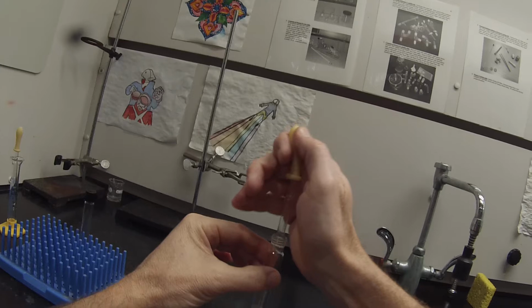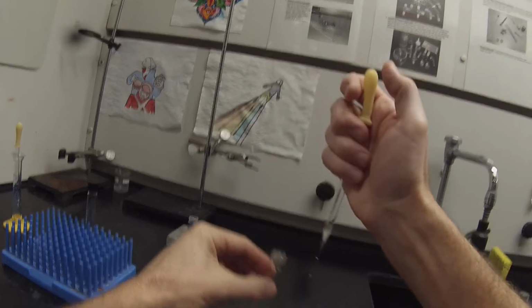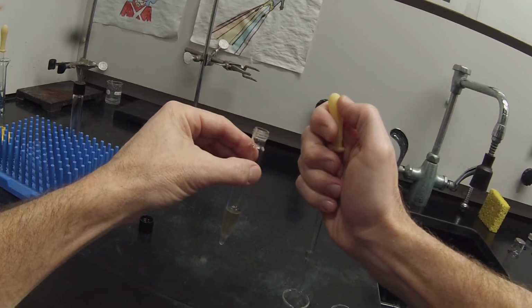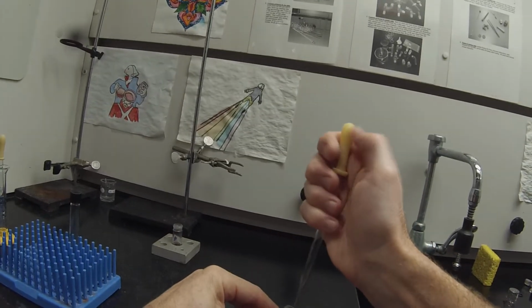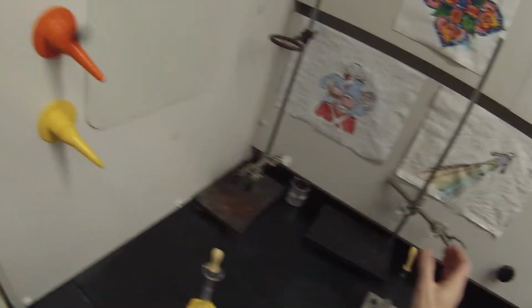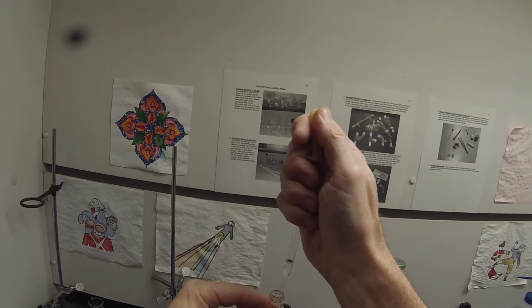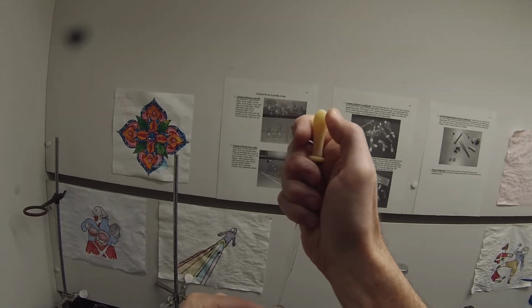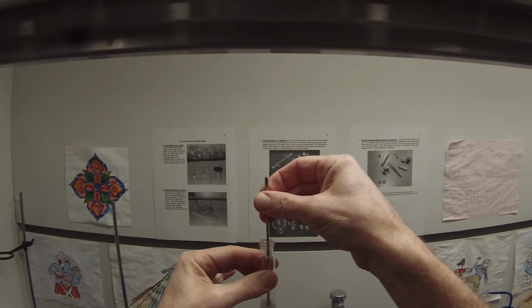And just a tiny little bit more. And we'll drip that aqueous layer in. And transfer the remaining top layer back. Add our third wash. Should get less CO2 generation this time. May need a fourth wash, so I got an extra milliliter there in case I do. And we still will get some CO2.